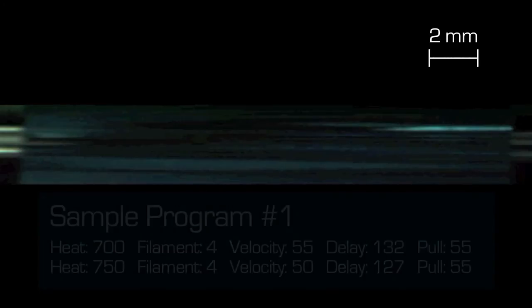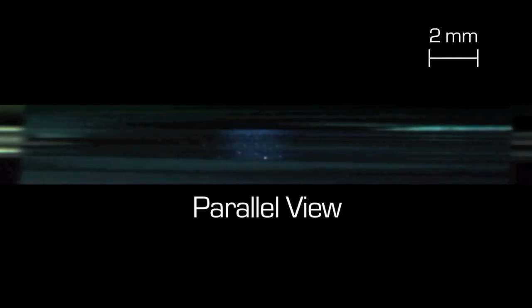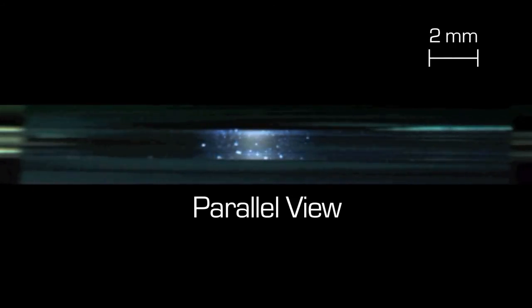We are viewing the pipette from the back of the puller above the axis of the laser beam. As the quartz capillary is heated it starts glowing white and only then it becomes pliable. The first pull draws the capillary to an hourglass. The second pull separates the glass after very short heating time.